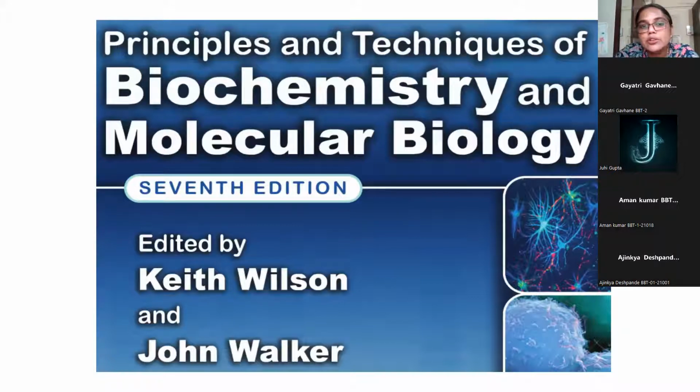Because when we are talking about research, we are using a lot of things. We are mixing them together and we see whether something is reacting with the other thing to give us something else. Now we say X plus Y reacts and they give you Z. Now what is this Z? What molecular chemistry does it have? What structure do the particles have? So basically, instruments are actually enhancing the rate of your work, because once you know that you have a certain product, whether that product is of your interest or not, you will decide when you identify the product.